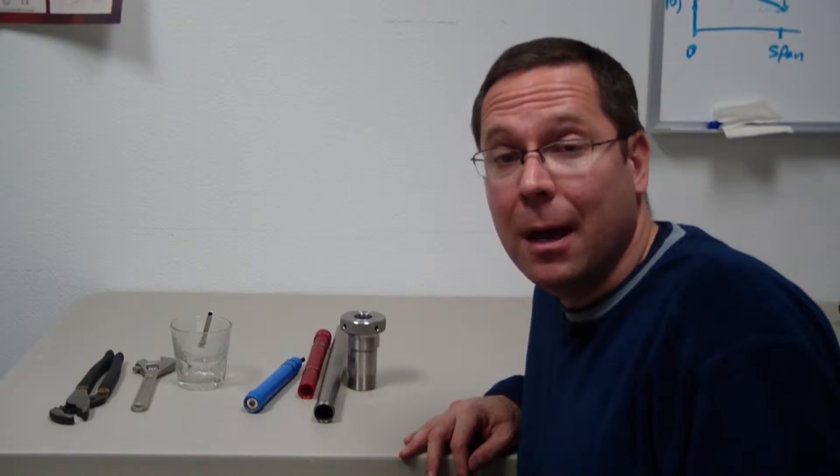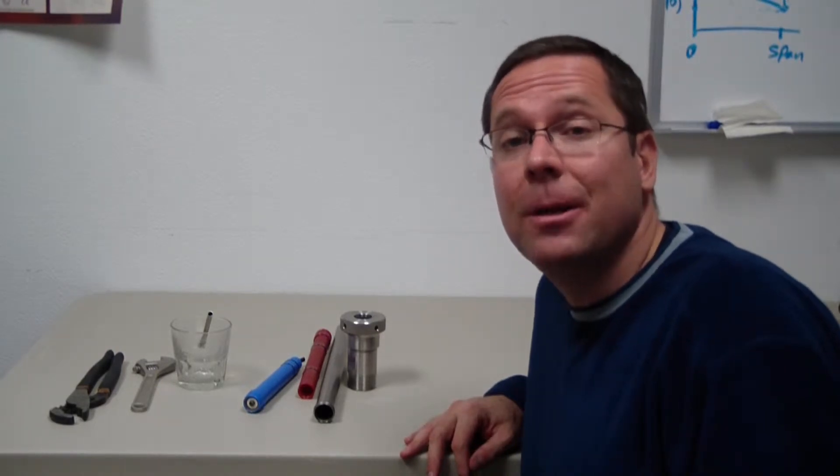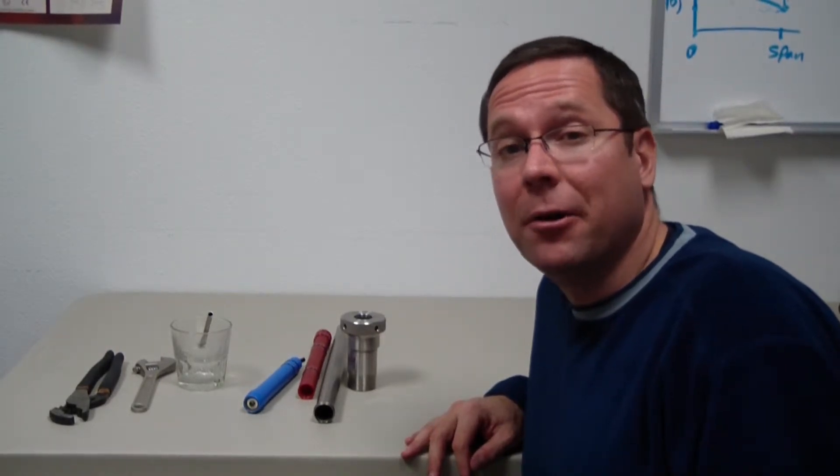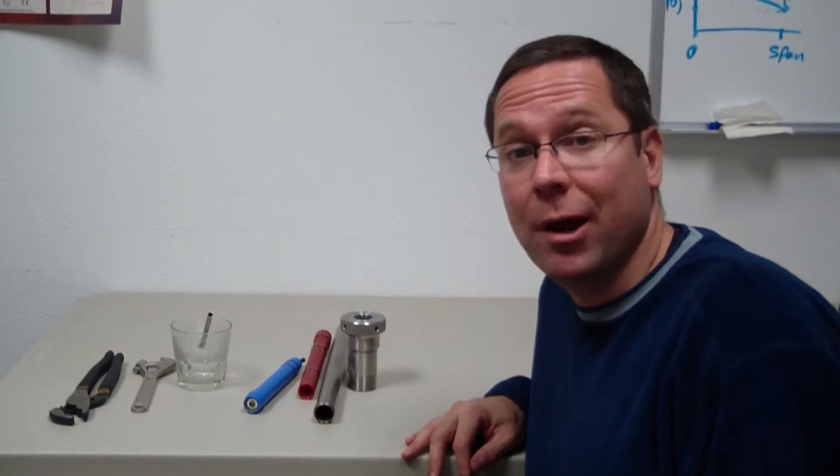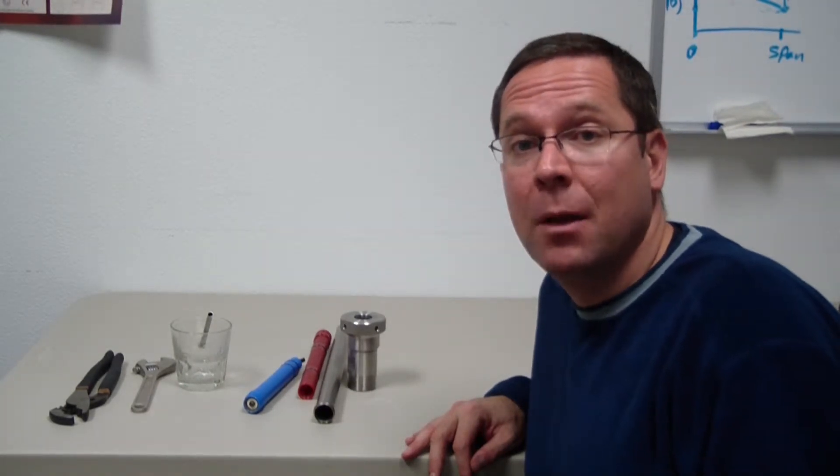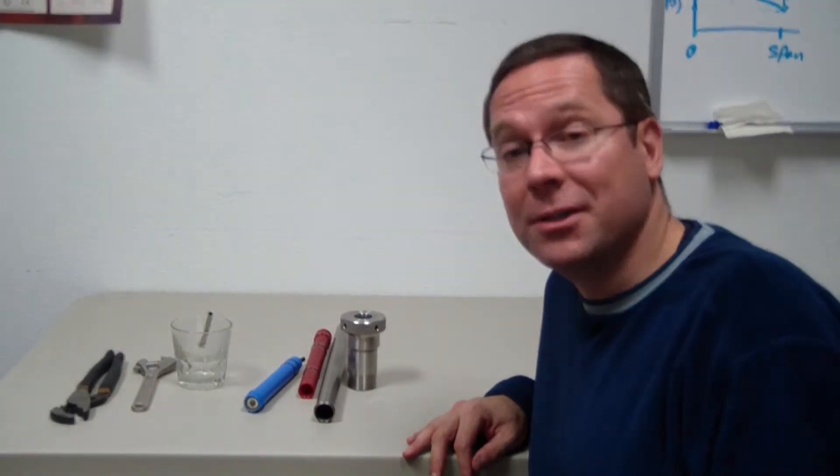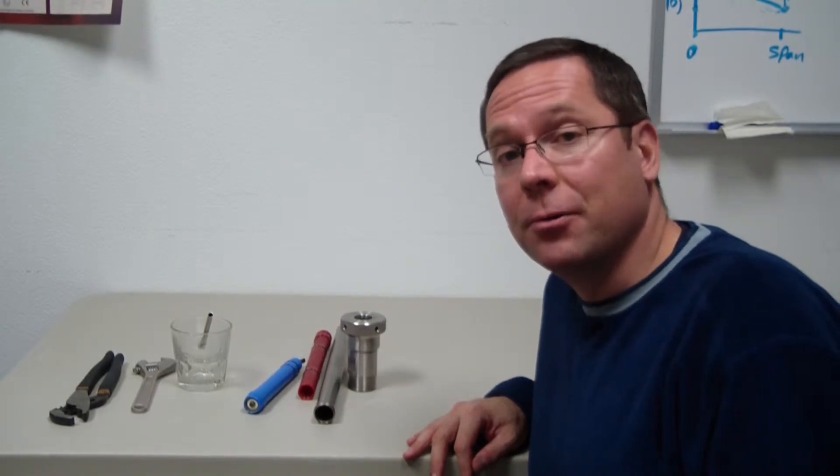Hi, my name is Steve Hammond. I'm with Barb and Analyzer Technology. Today we're going to talk a little bit about our 547 hot tap retractable pH sensor. We're going to take and assemble and disassemble the product and show you how it goes together.